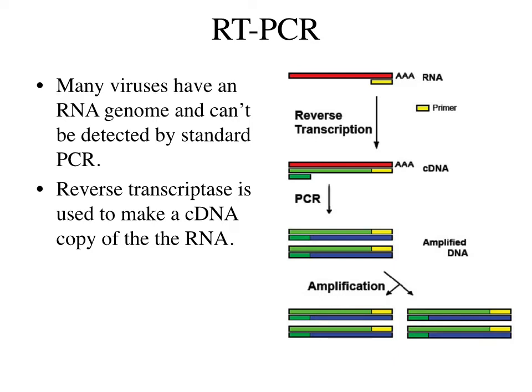PCR is based around the use of a heat-stable DNA-dependent DNA polymerase enzyme. For the PCR to work, we need to first make virus RNA genes or genomes into DNA so that the main enzyme can use it and duplicate it and make enough of it to detect or use in molecular biology, or whatever the downstream application may be.